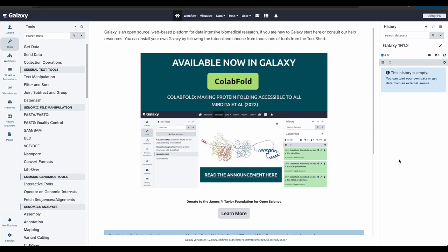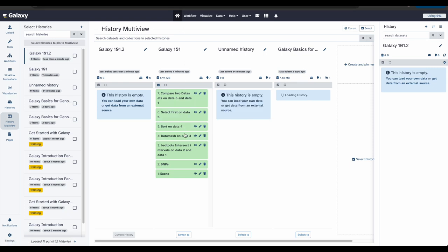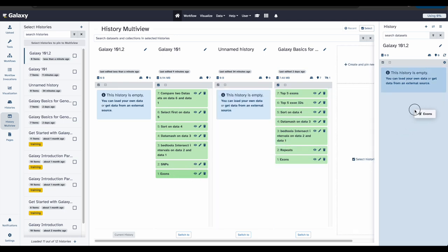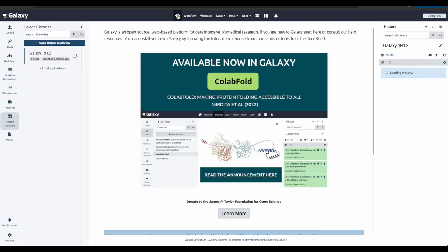Perfect. Now we'll need the dataset that lists the exons again. But we don't need to paste and fetch the data again. We can just copy it from our previous history. To do this, go over to the Activities bar on your left and click History Multi View. Under your Galaxy 101 history from earlier, you can simply drag and drop the exons data file into your new history. And now we have it in our updated history. Great. Now I'll click the Home button to bring me back to the Analysis window.